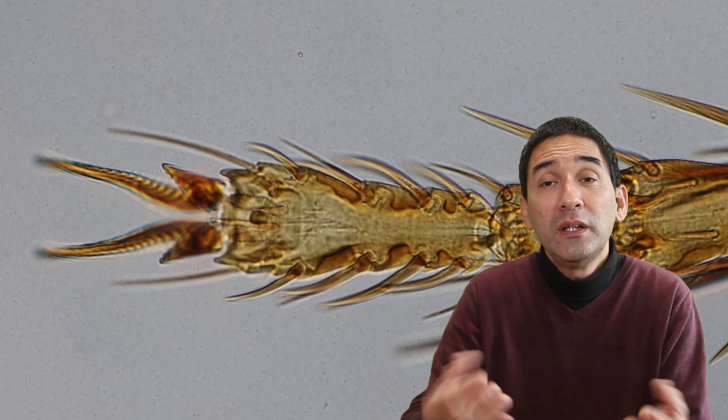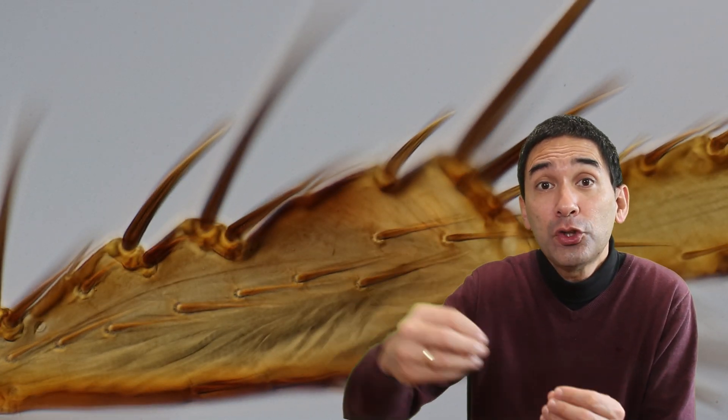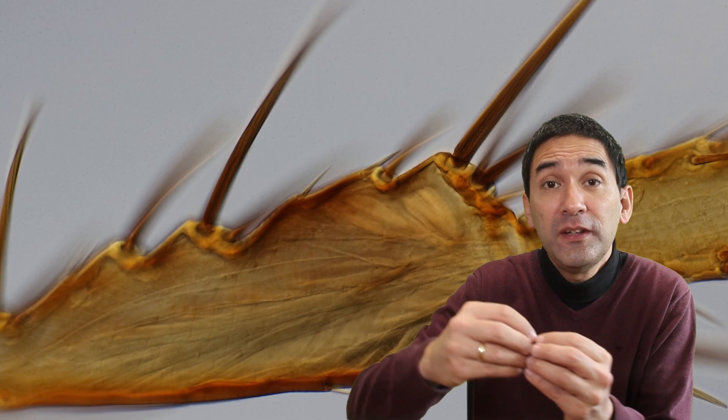So it's not only the tip of the foot that touches the surface but a large section of the lower leg. This part has all of the spikes and is used for actually creating enough friction for the flea to jump off.